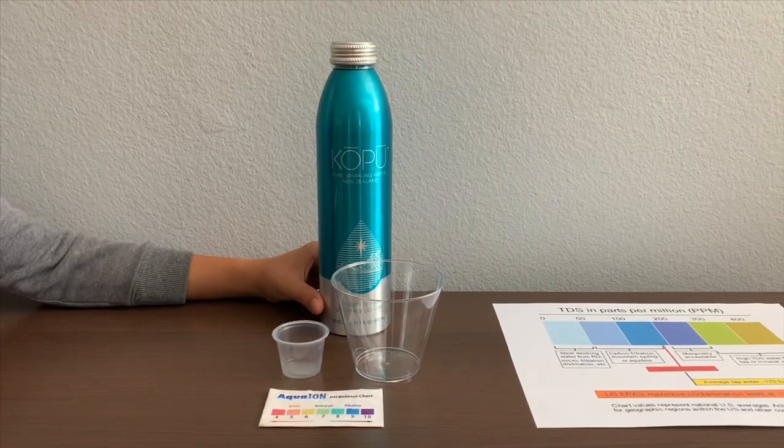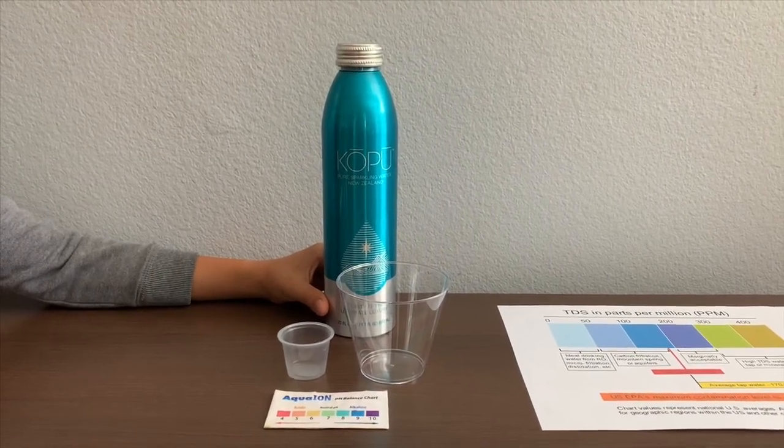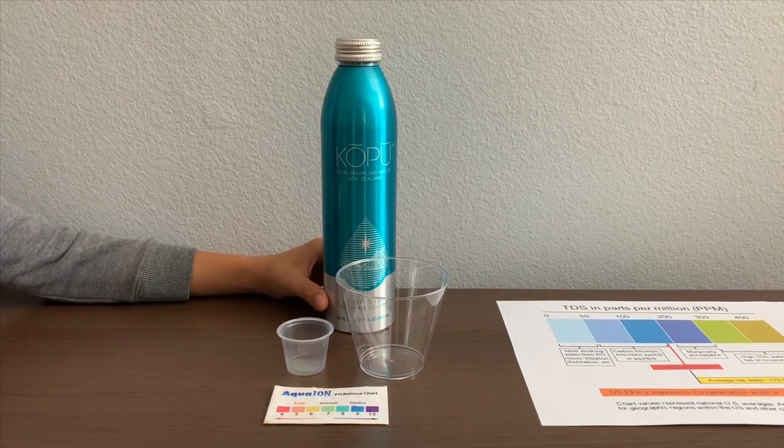This is Kopu Pure Sparkling Water from New Zealand. It costs $2.99. Let's test the pH and TDS levels.